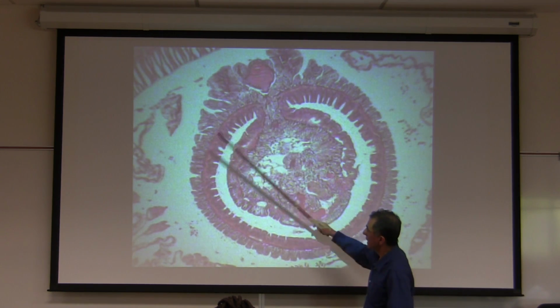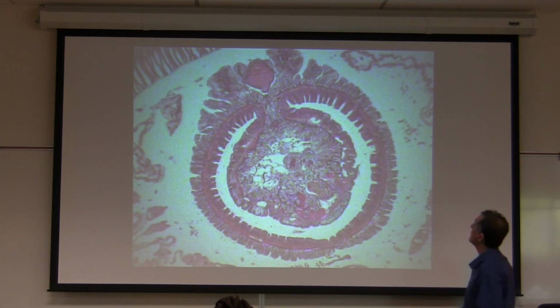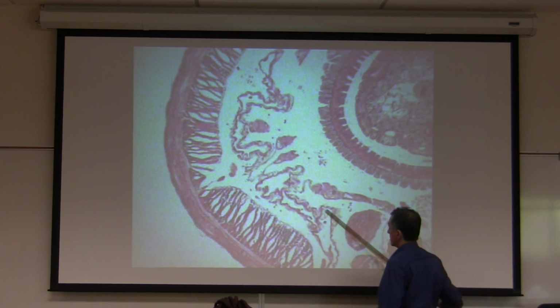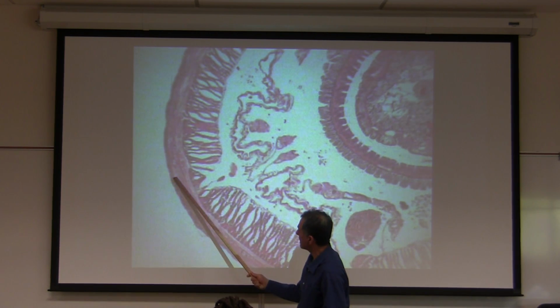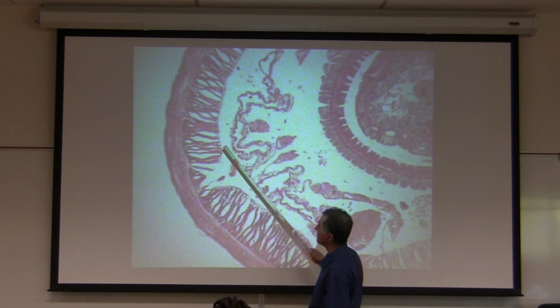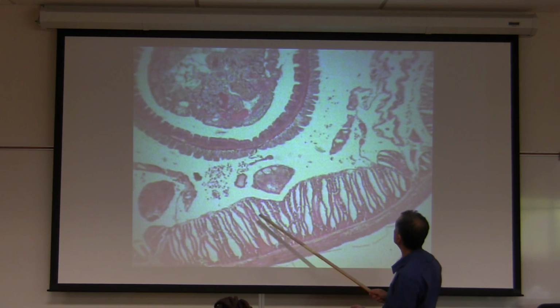Blood vessels. What is the name of the area or structure? Coelom. These are coelomate animals. And of course, nephridia right here. Nice and beautiful. What is the name of structure? Epidermis. Circular muscle. Longitudinal muscles. What is the name of the structure right here? Peritoneum. I hope I showed it.